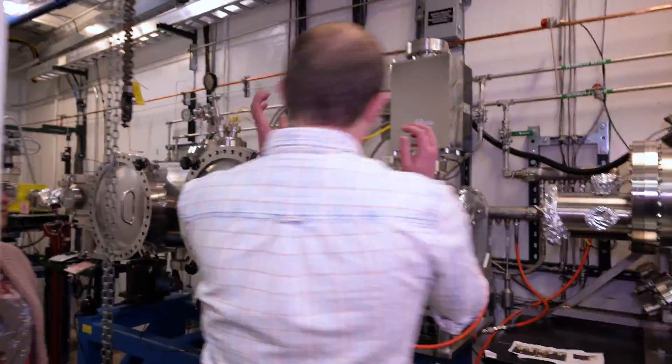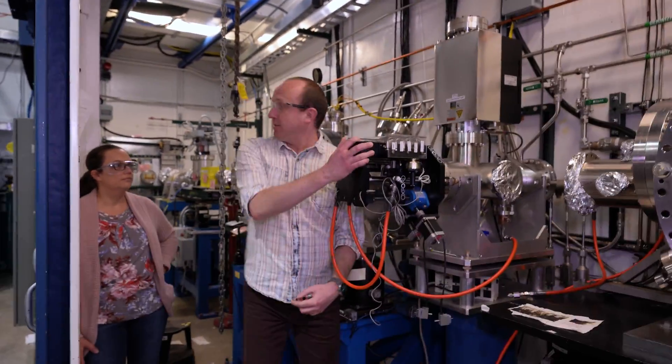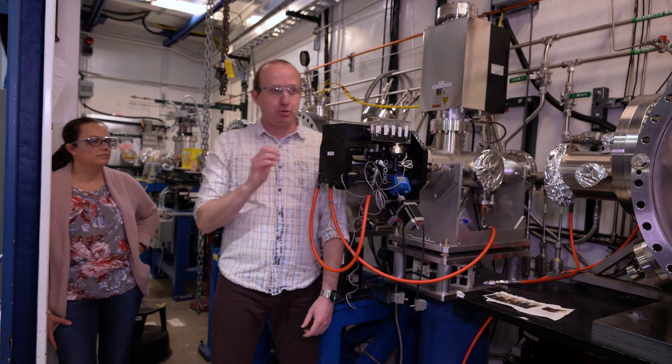All right, so here's our A-hatch, the optics hatch. All this equipment that you can see on our mission is just to deliver the X-rays to all the beamlines at sector 11.